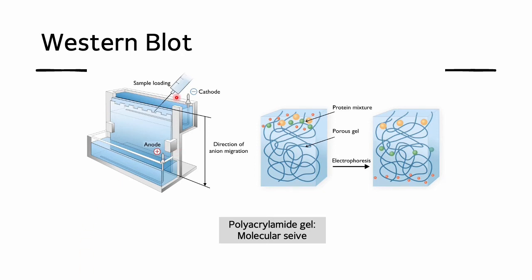So with the sample loaded here, we studied the factors that induce changes in protein moving speed and how we deal with them, especially with SDS and mercaptoethanol. Now let's look into how the gel is shaped.